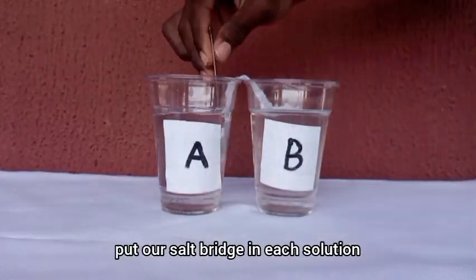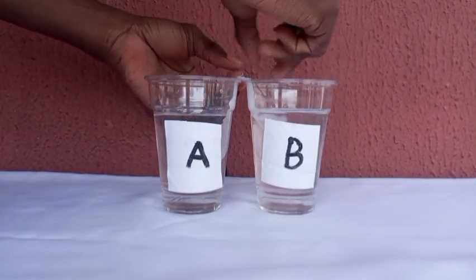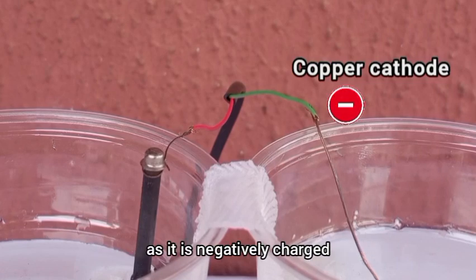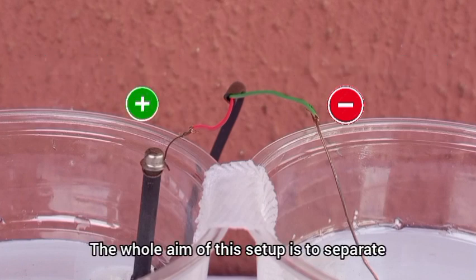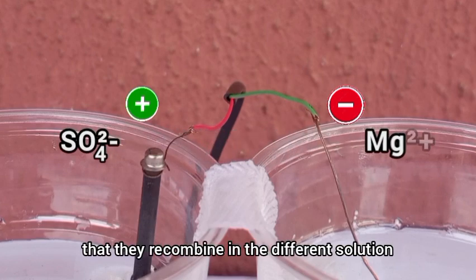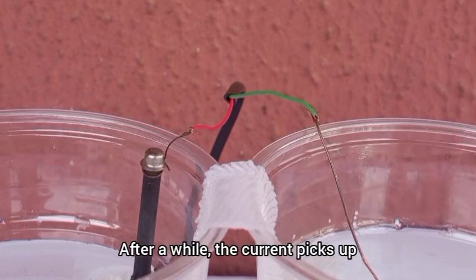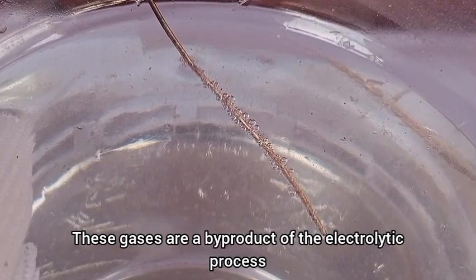We plug in our DC power supply, put our salt bridge in each solution, and insert our terminals. The copper terminal serves as our cathode as it is negatively charged, and the graphite terminal serves as our anode as it is positively charged. The whole aim of this setup is to separate the ions of the salt away from each other so that they recombine in the different solutions, forming our hydroxide and our sulfuric acid. After a while the current picks up and we start seeing bubbles — these gases are a byproduct of the electrolytic process.